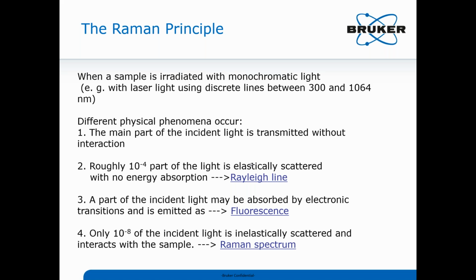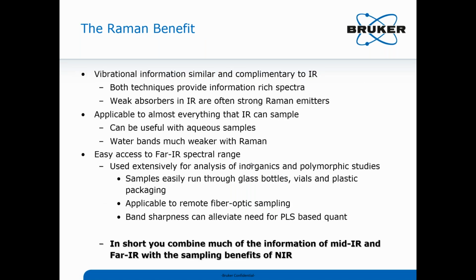Rayleigh scatter. Or you can also have fluorescence, where you have an attractive potential energy surface where you have a transition that would yield fluorescence. As it turns out, that can be a very bright or efficient process and can dwarf the Raman signal, which you can see as much weaker, 10 to the -8 to 10 to the -11 probability typically. So Raman is typically weaker when you want to do a quantification of dilute samples, but it can give you very rich information similar to the IR.